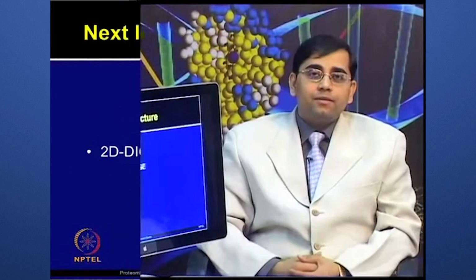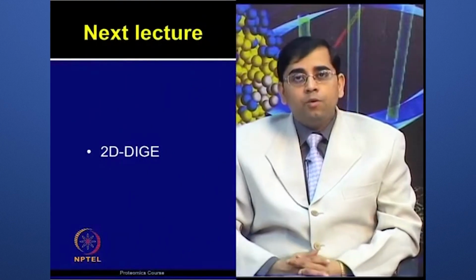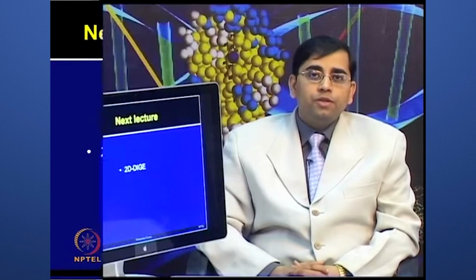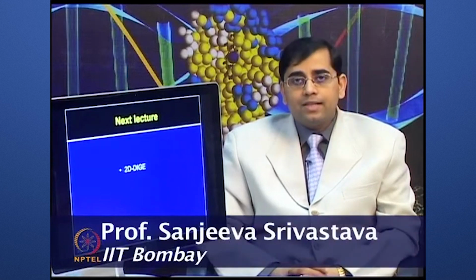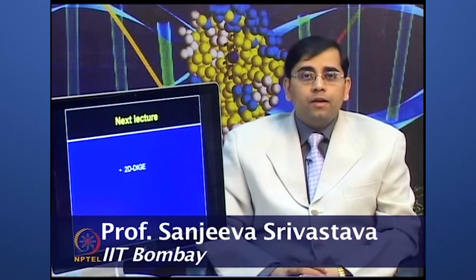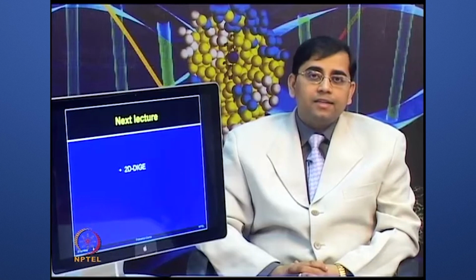In the next lecture, we will continue our theme on gel based proteomics, and I will introduce you to a new technology, 2-dimensional difference gel electrophoresis or 2D DIGE, and then we will continue our lectures on 2D DIGE and its image analysis.